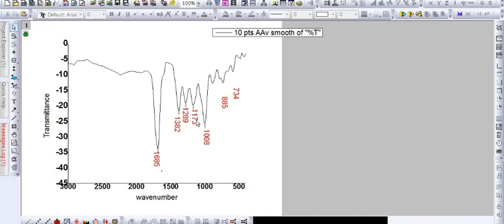This seems very simple, but it is important for designing and proper visualization and representation of the FTIR data. And the last one. So this is how we have arranged the values.